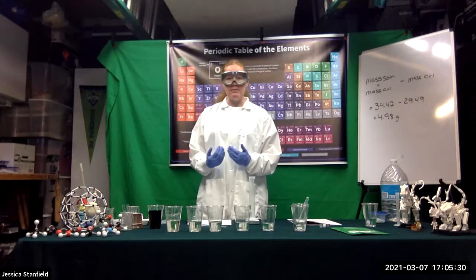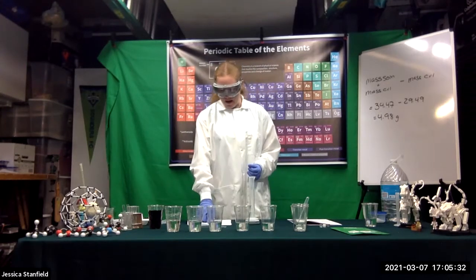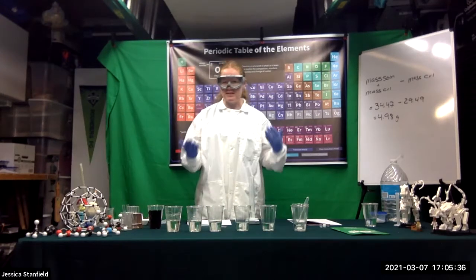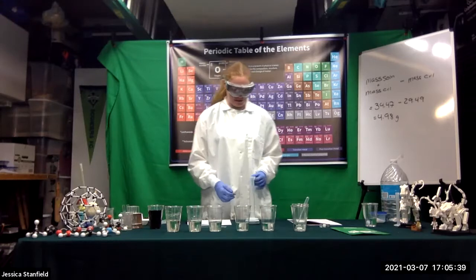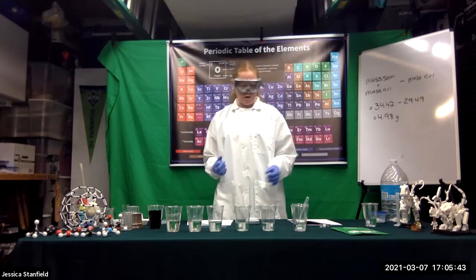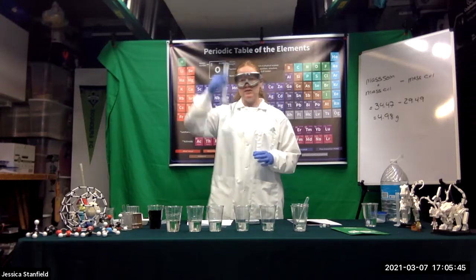Now, I recommend getting all of your measurements first and then calculating your mass of solution when you're done. So I would just bust out all of your measurements and then do calculations. All right. So you'll do that for the 0%. Now the 0% is just water, and so cleanup will be easy. You just need to pour this out.